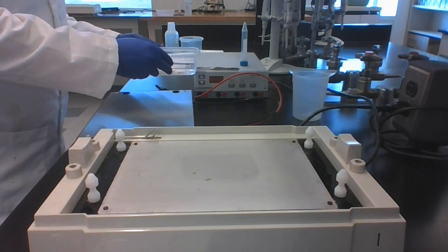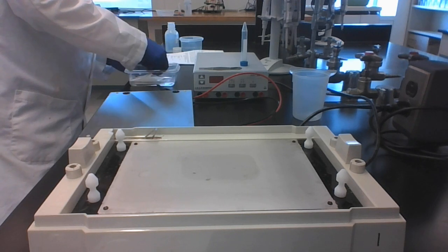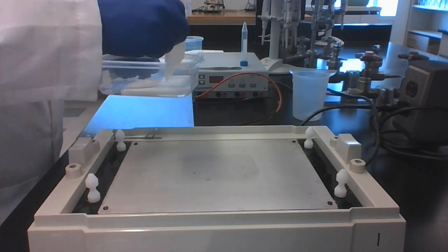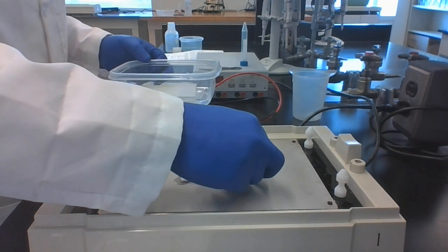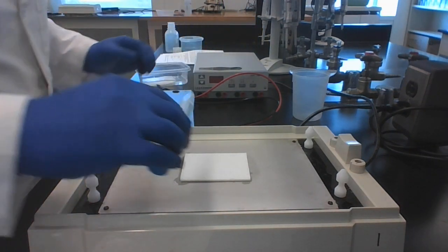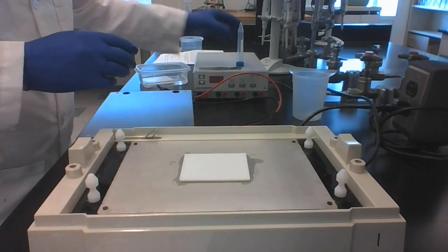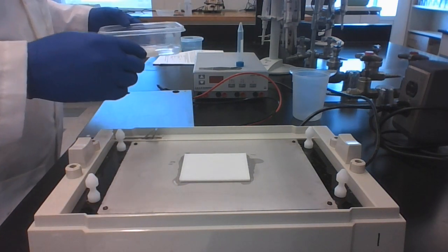So now that these are equilibrated, we just take them when we first put down a filter paper. And then we take some sort of tube and we just roll out any air bubbles. If there are air bubbles that can inhibit the transfer of any proteins.